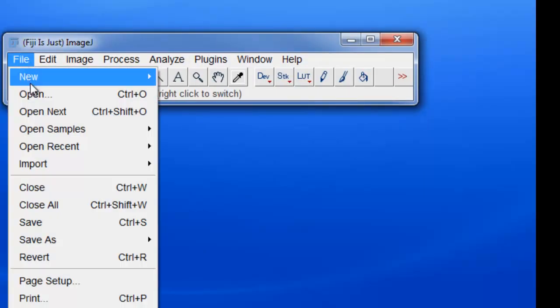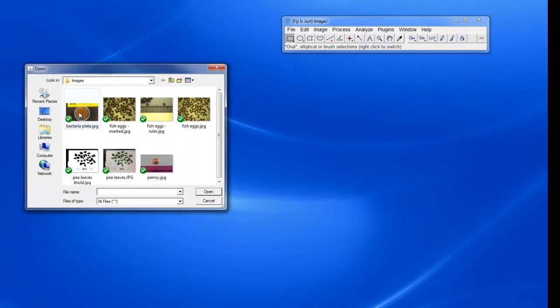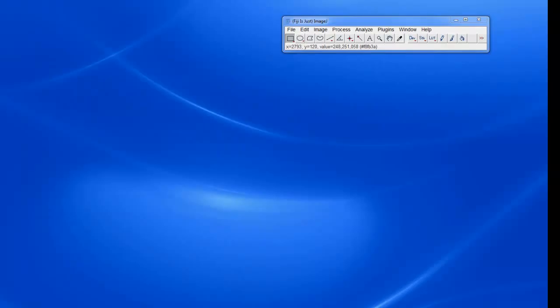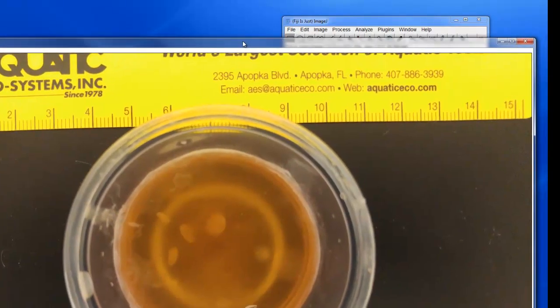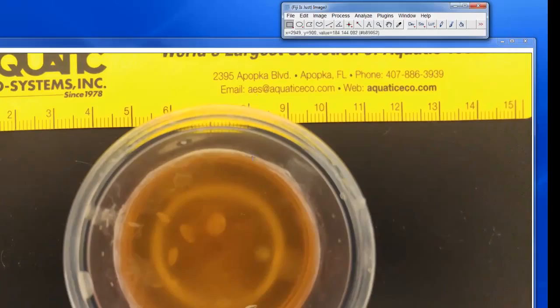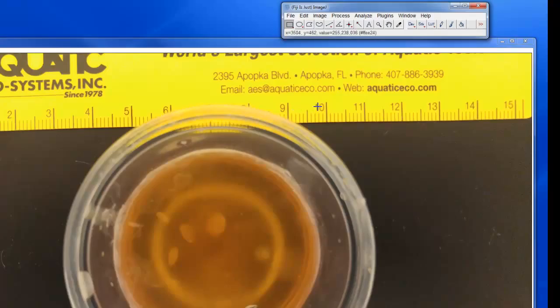We're going to go to File > Open and I've taken a picture of one of the petri dishes. You can see some colonies on a dark background, which helps them show up. You'll also notice I made sure to get a ruler in the picture with the petri dish. This is critical — you need the ruler to calibrate the software. Once calibrated, you can determine the area of colonies in square millimeters, but only if you have something of known size in the picture.